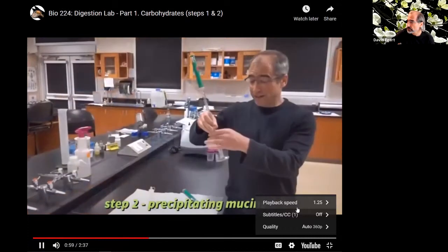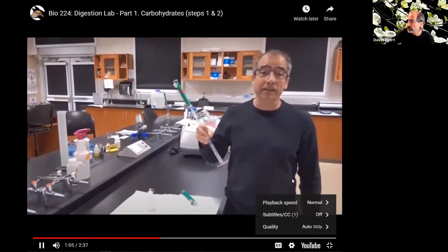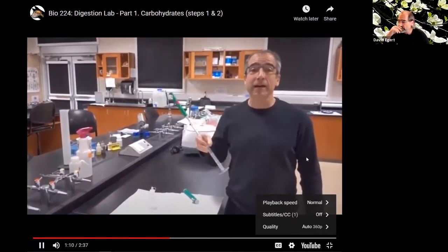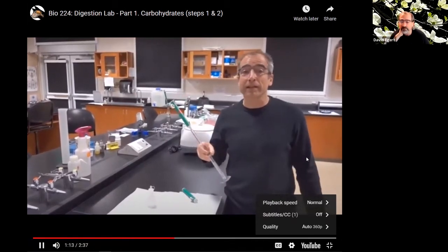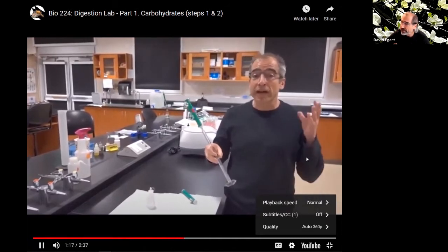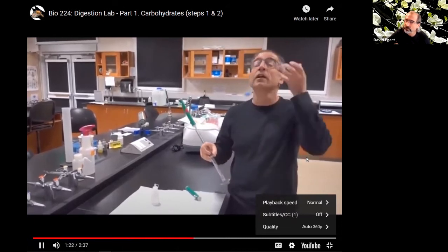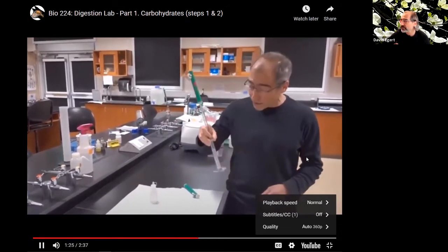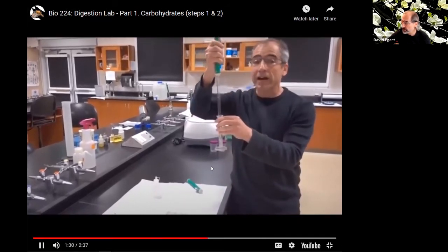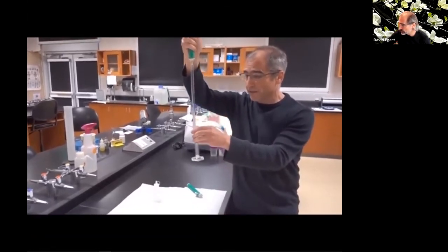So here again is my lab partner's saliva that we were using as our source of the amylase enzyme for the carbohydrate part of today's lab. But saliva has a couple of roles. One is helping break down carbohydrates when you're initially chewing up your food, but it also has mucus that helps bind your food into a bolus, a nice little slippery ball you can swallow down your gullet. And we can actually see that other aspect of the saliva if we take some saliva here.